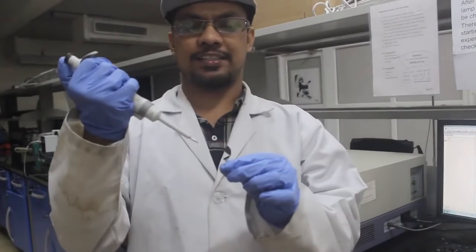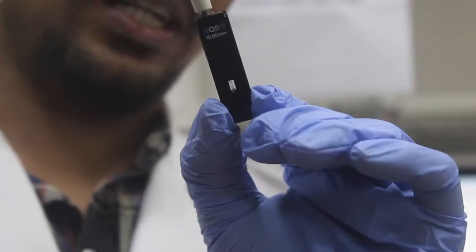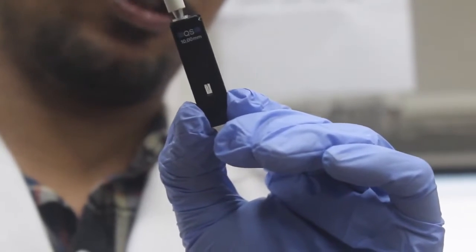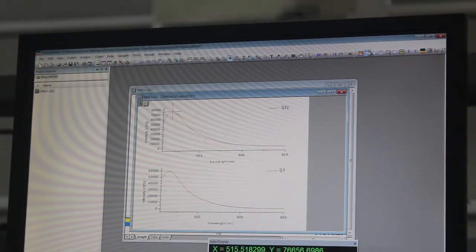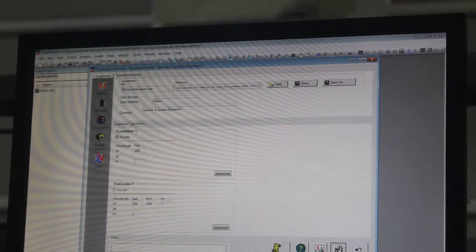Now we attach another strand of the DNA which is attached to the Texas Red. We mix thoroughly and keep it for some time to let both strands hybridize. After waiting for around 10 minutes, we start exciting again. The donor excitation light is the same configuration.